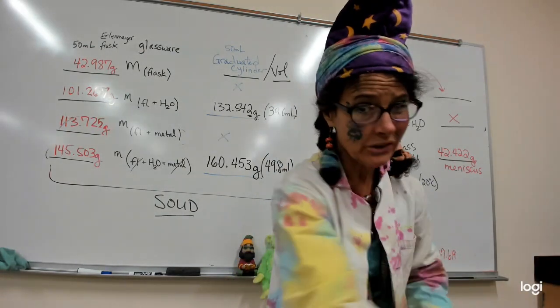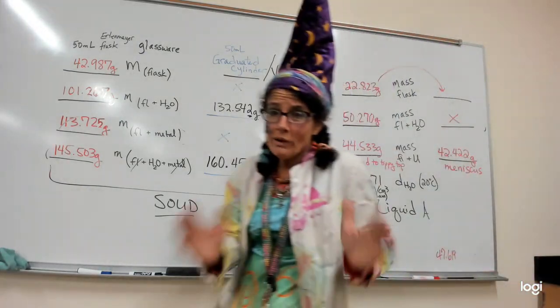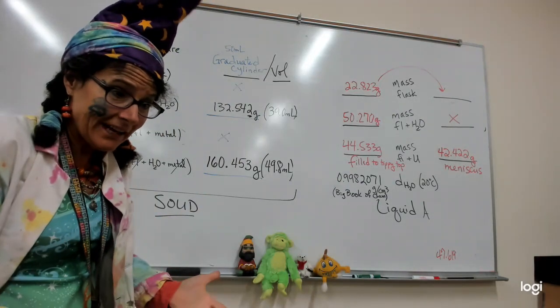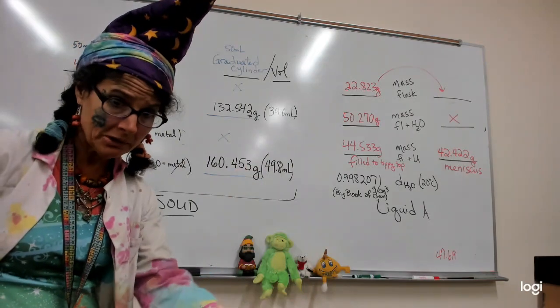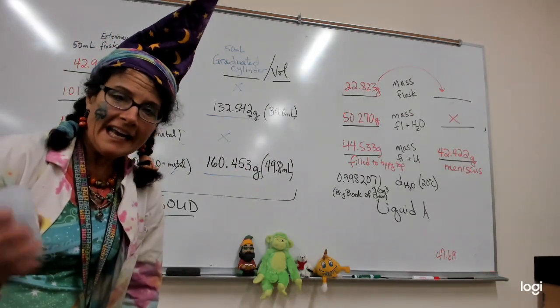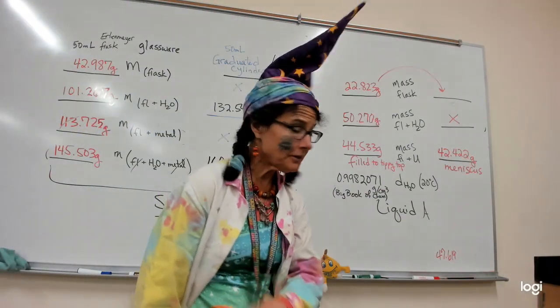You actually need to know that because you're going to decide how I did. You're going to figure out which way was more precise and which way was more accurate. So you're going to have to Google the actual density of isopropyl alcohol, or IPA, right? And of aluminum, and see how I did. So I did each one 2 different methods.